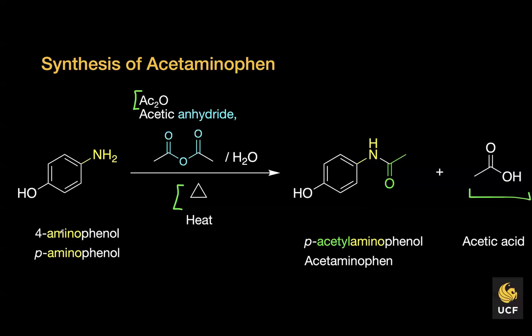And if you're not very familiar with nomenclature, I've highlighted the amino, why we call it aminophenol. The bottle says 4-aminophenol, but you've learned in organic two that that's the para position, so para-aminophenol. You could use either one. Acetaminophen, again, is the common name. We could also call it para-acetylaminophenol.